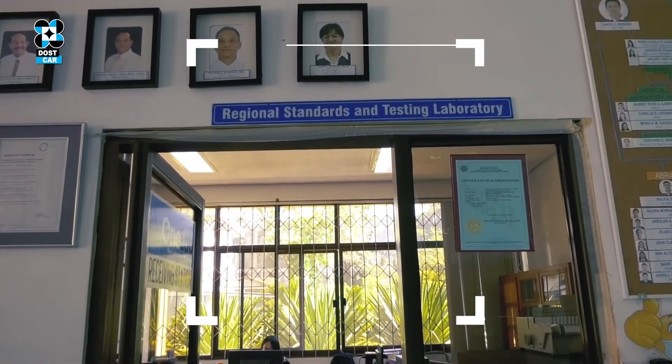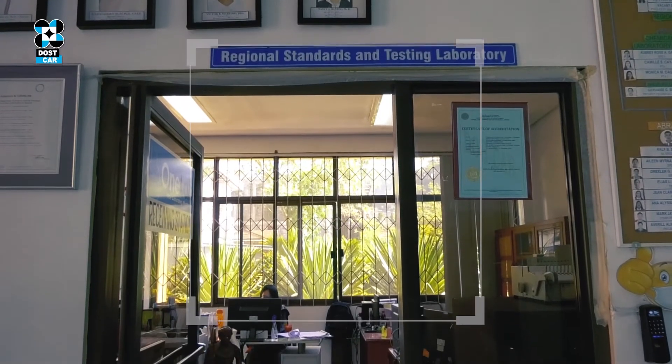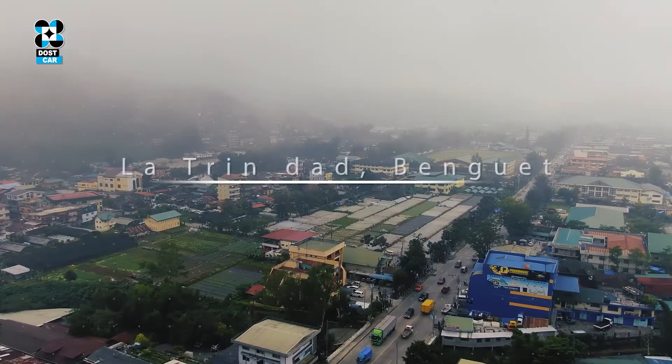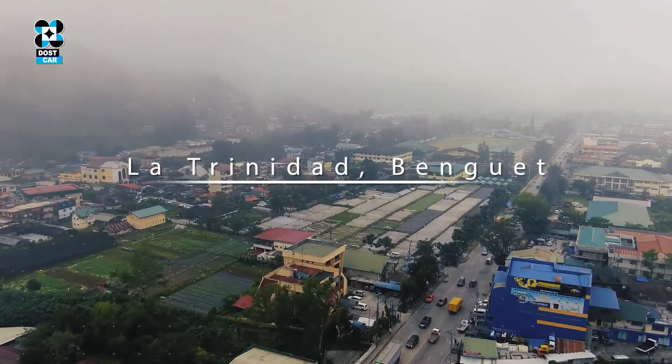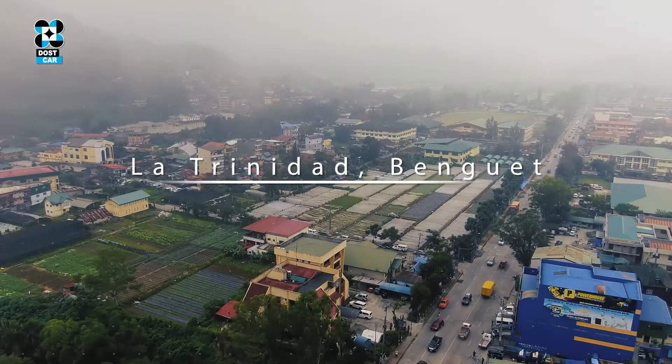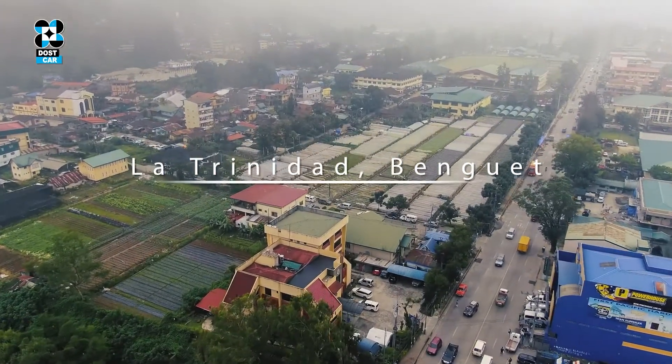The Regional Standards and Testing Laboratory, located at the Regional Office of the Department of Science and Technology, Cordillera Administrative Region in La Trinidad Benguet.